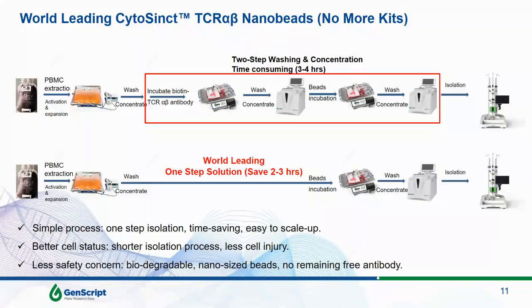So this two-step isolation is very time-consuming and tedious compared to the one-step isolation, pictured in the bottom lane.